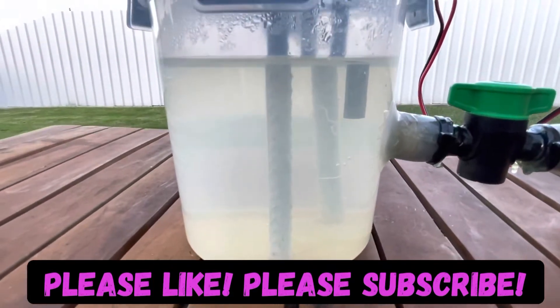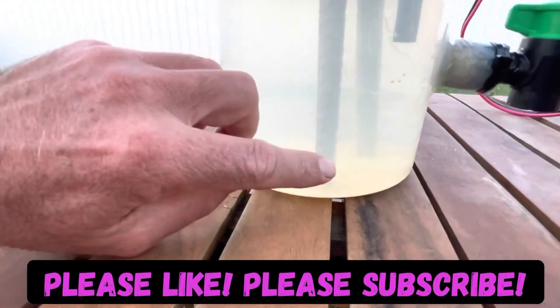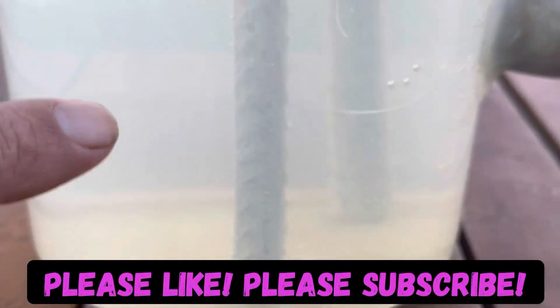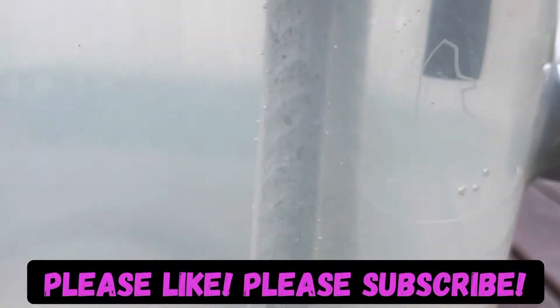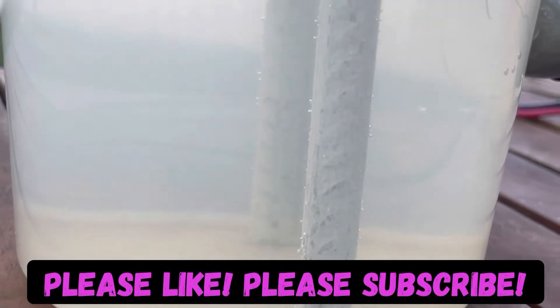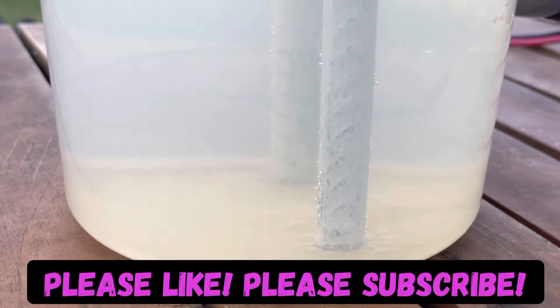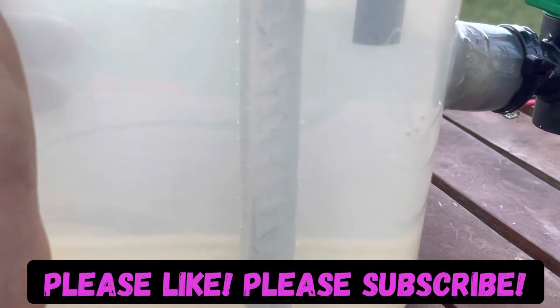The way I'm going to achieve that is by removing this lid here, cleaning up these rods and removing all the white build-up on them. By doing that I'm going to re-expose the iron and put them back into the solution, and hopefully that gives it a better opportunity to actually process the remaining salt in that half of the electrolytic cell.